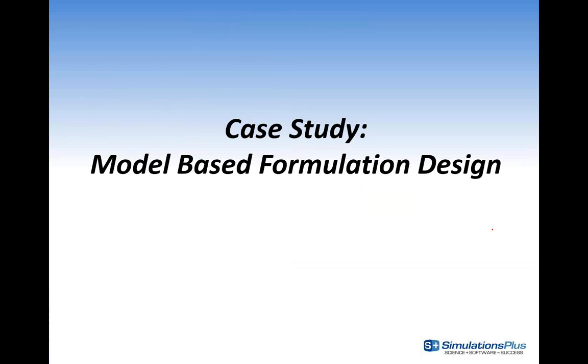So now to our case studies. For our case study, we're going to be going through a model-based formulation design. And this is going to be using the functionality within GastroPlus to define IVIVC correlations, and then using those IVIVC correlations to back out what the in vitro dissolution profile is for a target PK profile, and then designing a formulation and the amount of polymer in the formulation to hit that target in vitro profile, and then in vivo concentration-time profile.